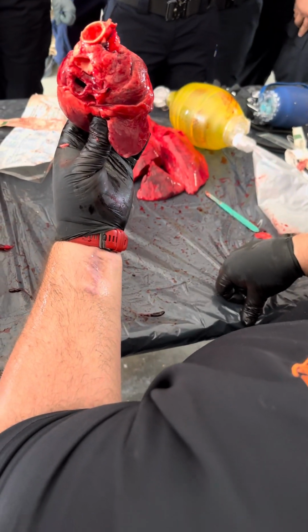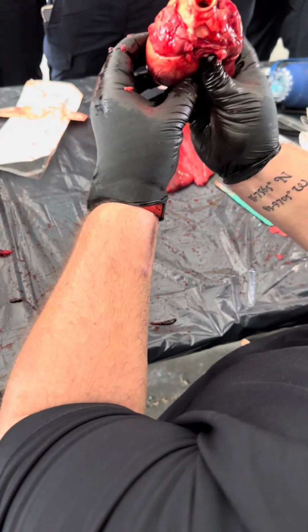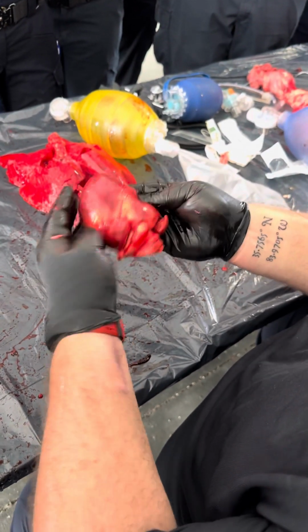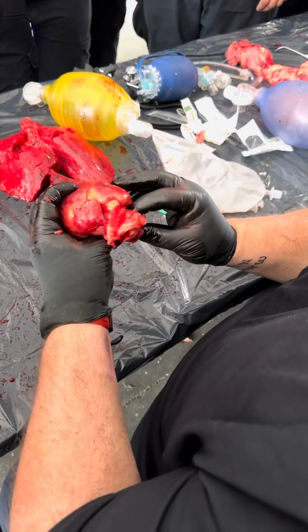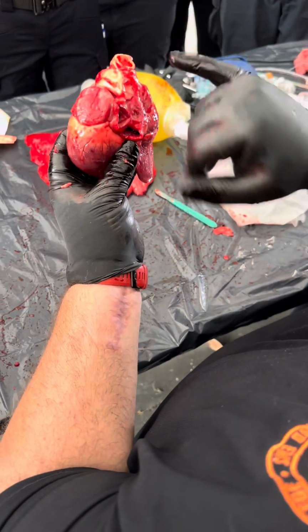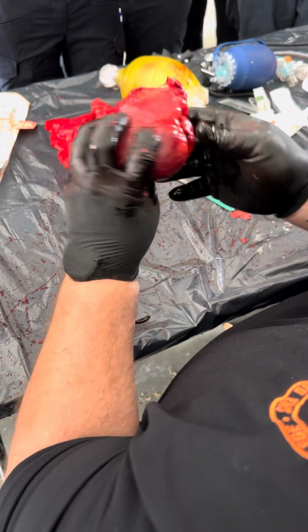of the heart, okay? So at the top, you've got your two atria, right atria, left atria, right ventricle, left ventricle. You can tell there is a significant difference in thickness and feel between the right side and the left side. As you run down the center of the heart, you've got your aortas up here. Your aorta actually is this one. This is your aorta. We'll see it from the inside.